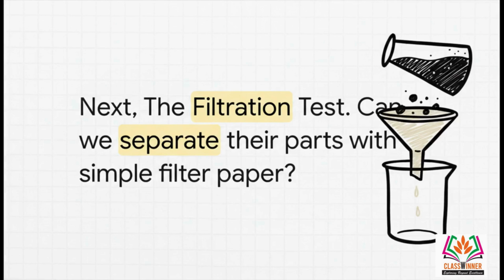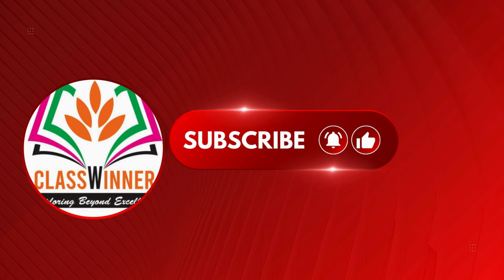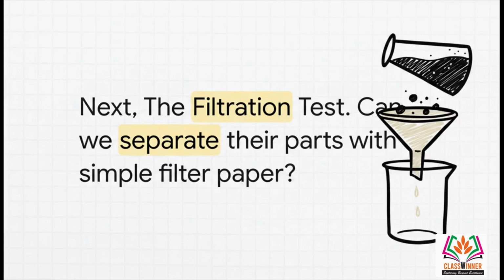All right, on to test number 2, the filtration test. We're going to pour each of our mixtures through a standard filter paper. The big question is, are the particles small enough to sneak through the holes, or are they going to get caught?